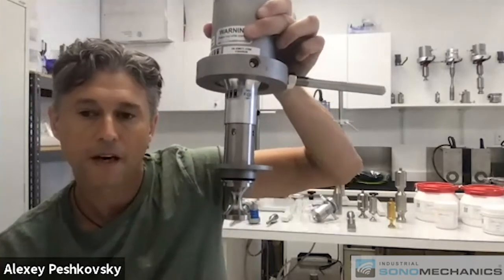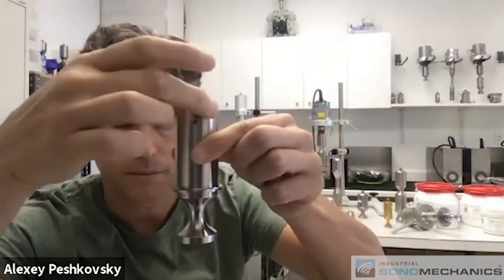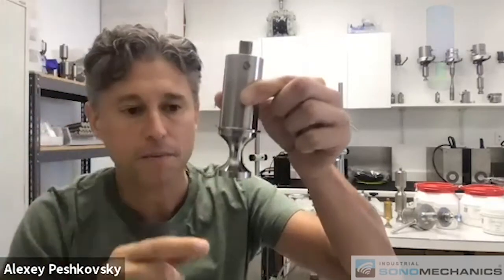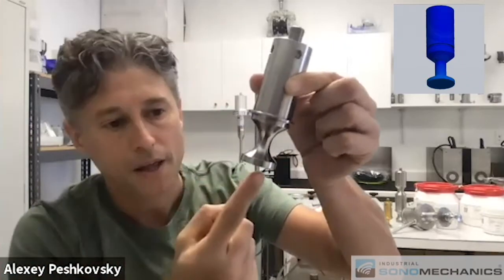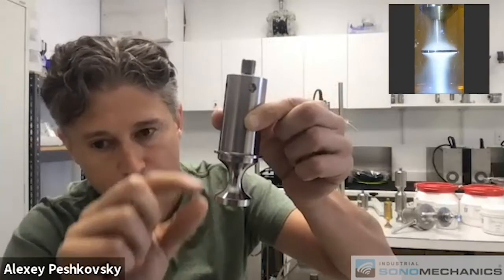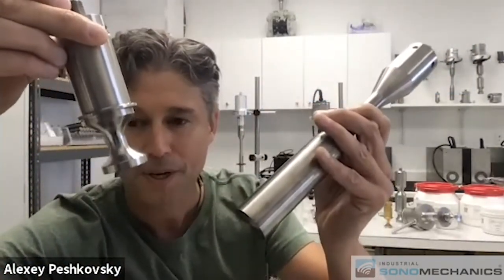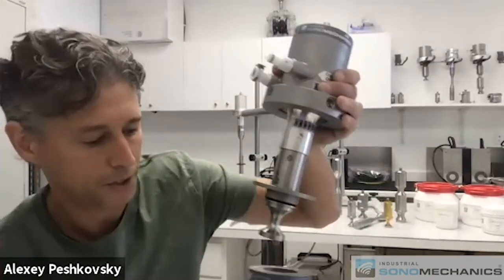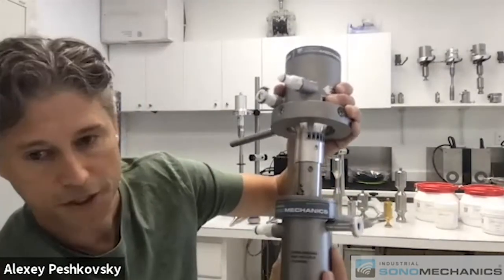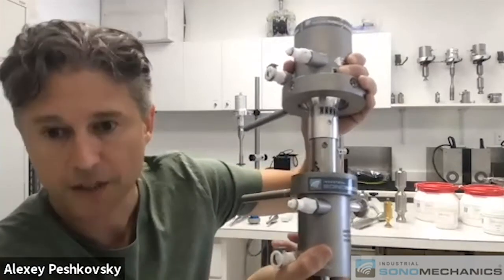We call this horn the HBH, and it has other advantages. This horn starts with a small amplitude at the end the transducer is driving, and has a tip that vibrates with a large amplitude — 90 microns or so — forming a cavitation zone under it. But because it's thin and the whole thing vibrates up and down, you have another cavitation zone up here as well. So even though this horn is much smaller and lighter than a conventional horn, it's actually twice as large in terms of its output area and is more powerful. It pairs with a reactor chamber that has a cooling jacket so you can maintain temperature.